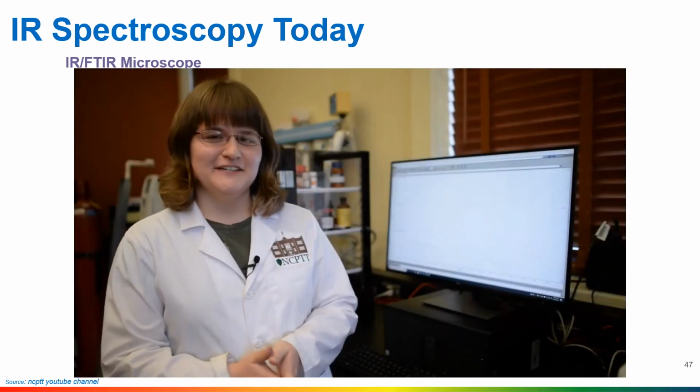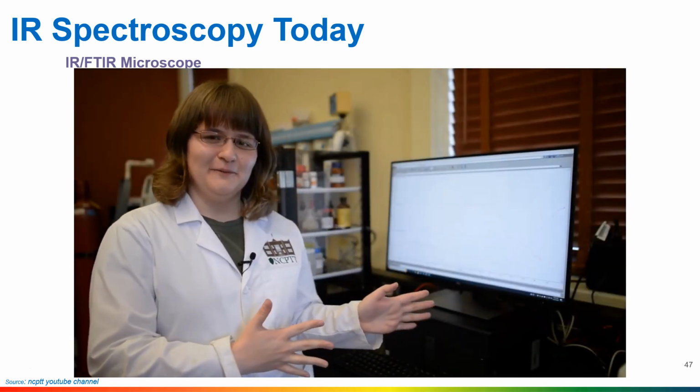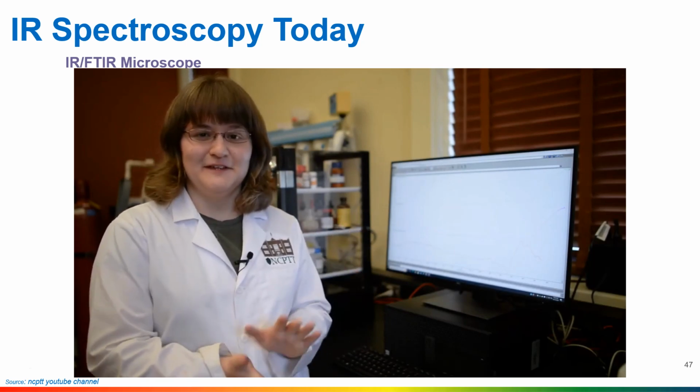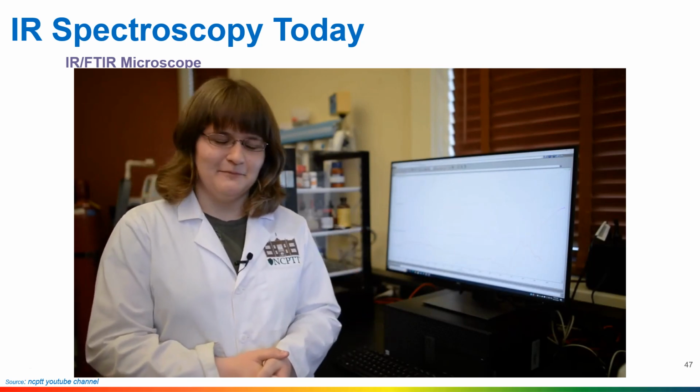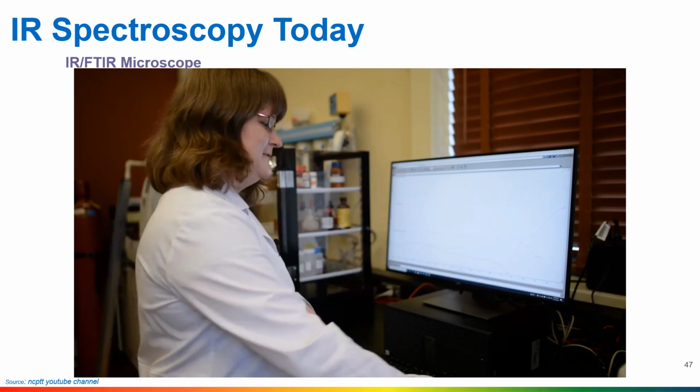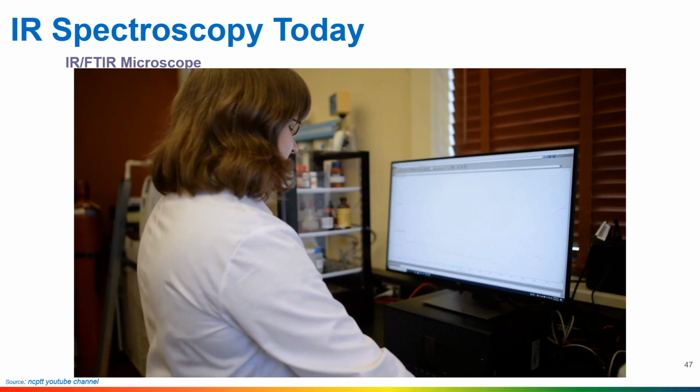So now that we have our spectrum, we come over to the computer where we're going to analyze them, and you can see here a couple of representative spectrum that are produced from some of my earlier samples. But I'm specifically going to be focusing on the limestone one itself, so I'm going to switch over to that really quickly.